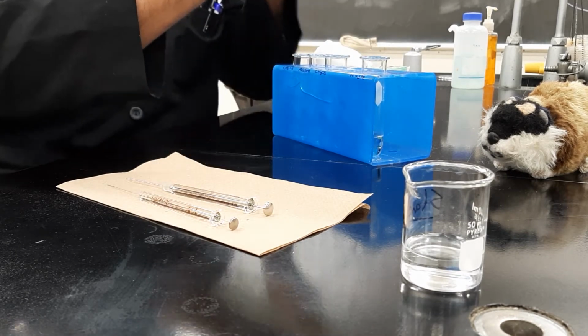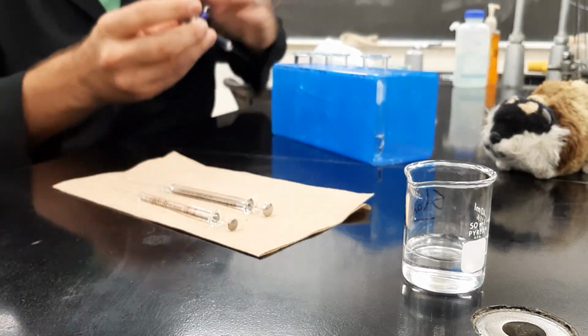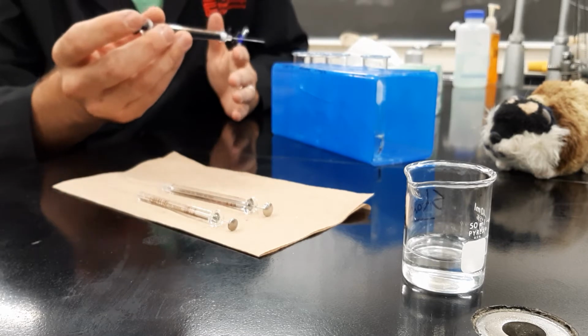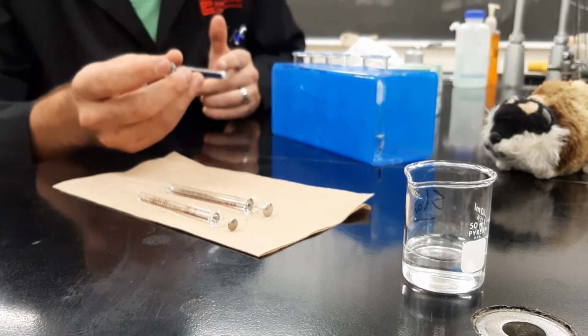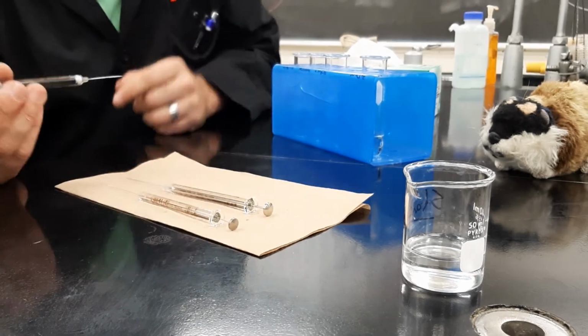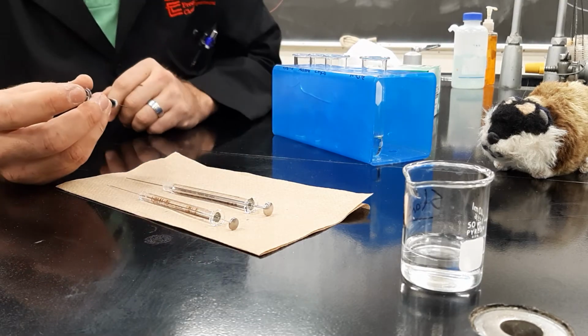because some contaminants that might be in there would be more soluble in different solvents. And the solvents you alternate are really up to you, whatever would be appropriate for cleaning out your syringe, except you always want to end the last one in whatever solvent you're using in the rest of the analysis, whatever the solvent in your standard is or whatever.